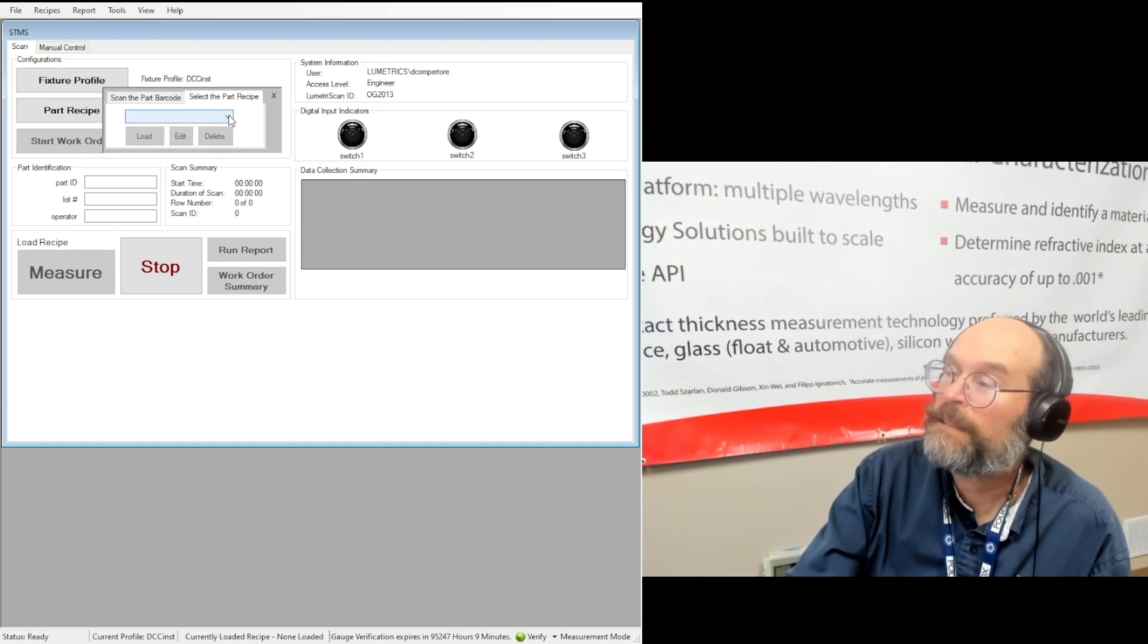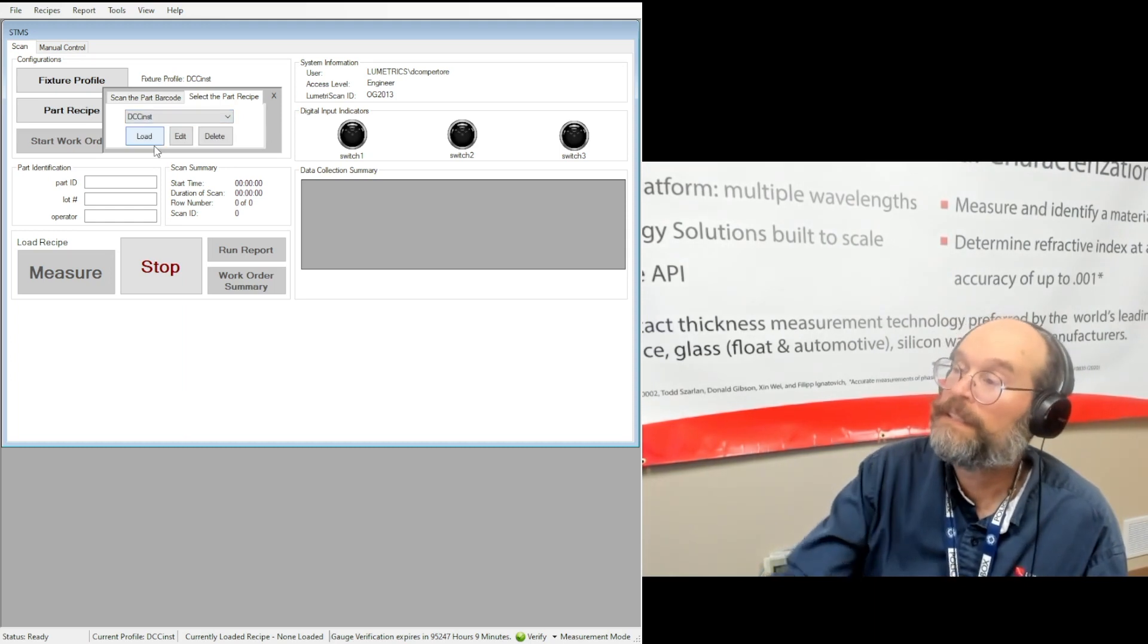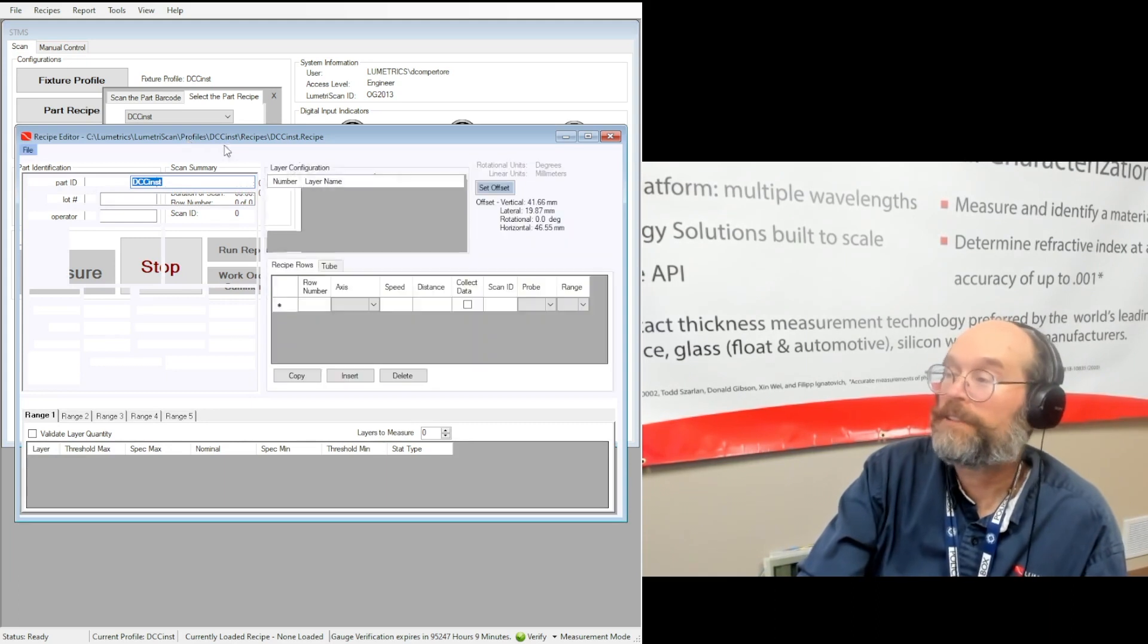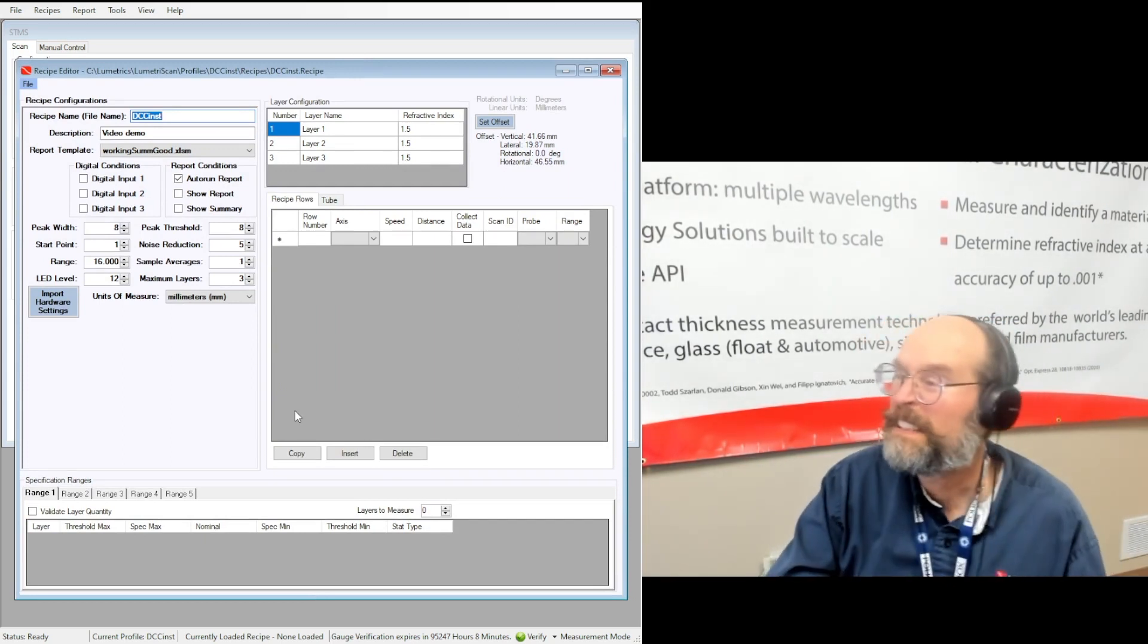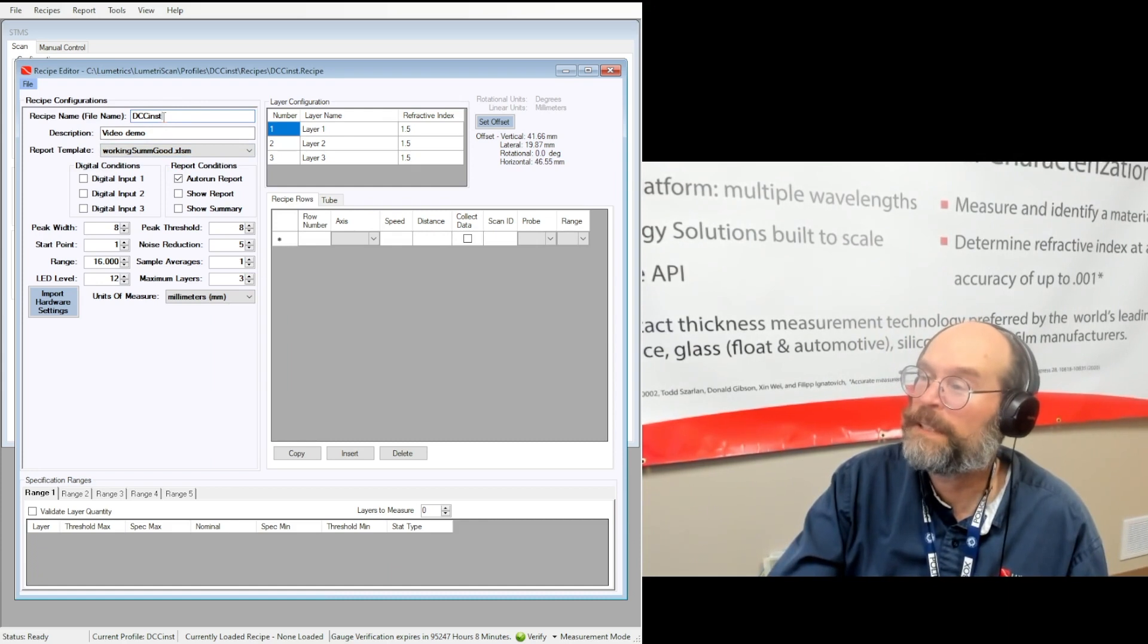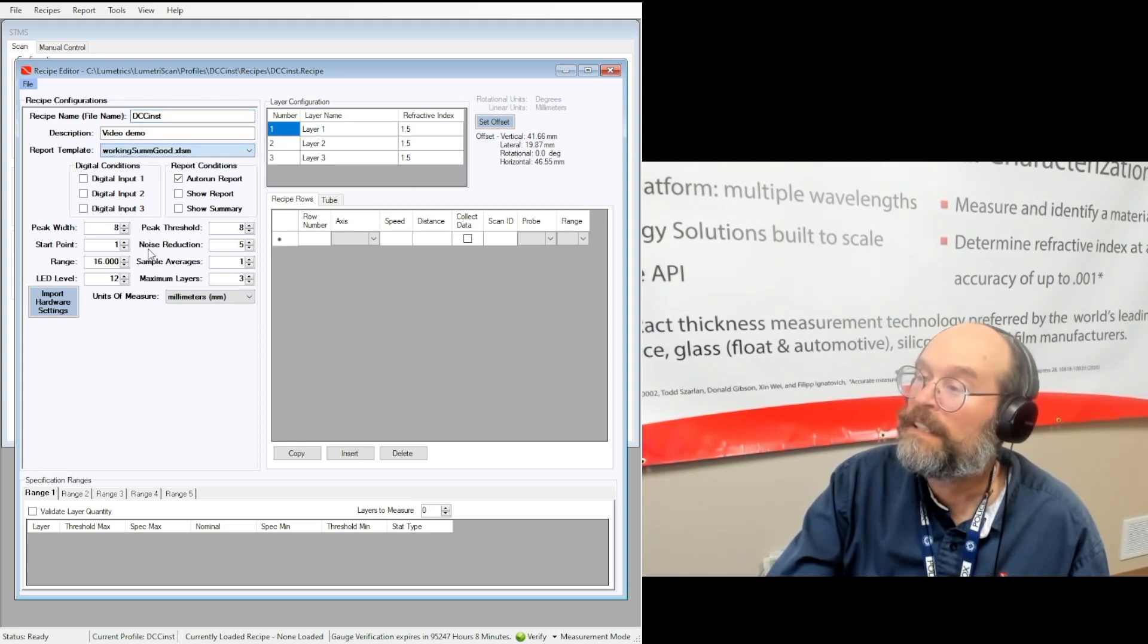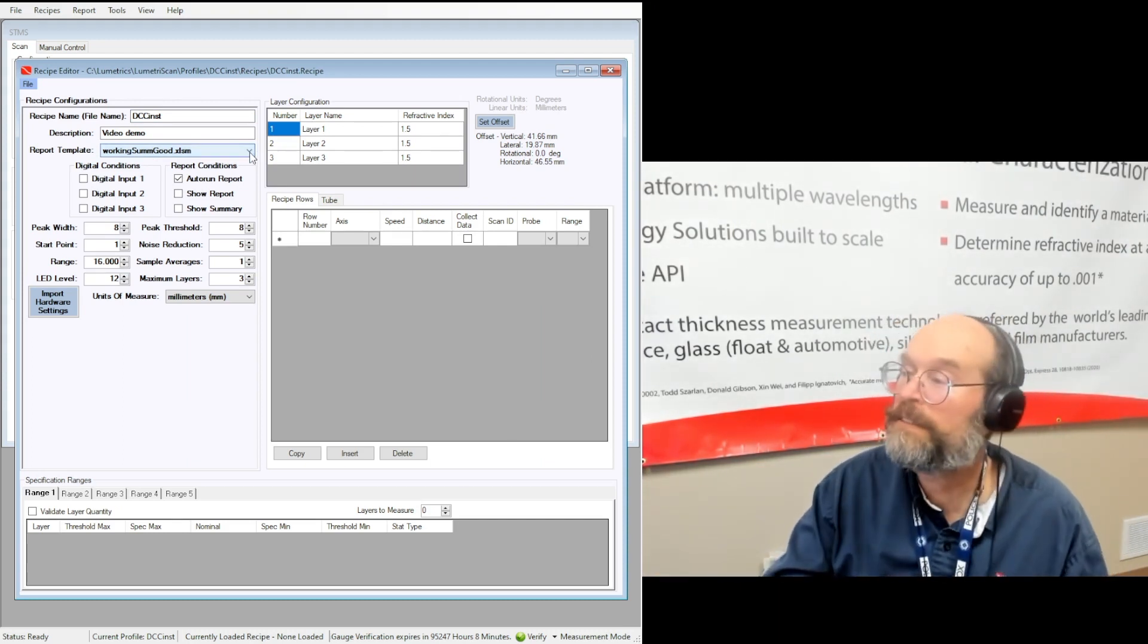So part recipes, again, I already started one. And it can be the same name, DCC INST. And we'll actually edit it. And I'll show you what, actually I'm going to add a few instructions here because this is what I wanted to show you mostly. So you give it the name, which is up here, DCC INST video demo. And I've selected a template that will accept the data and do some analysis. That could also be another video.